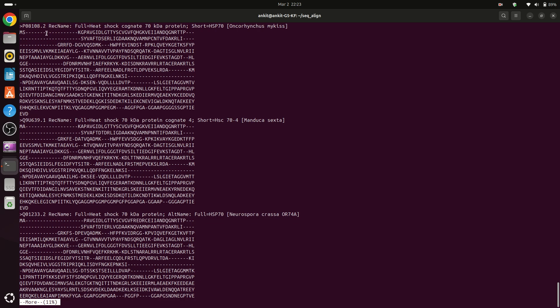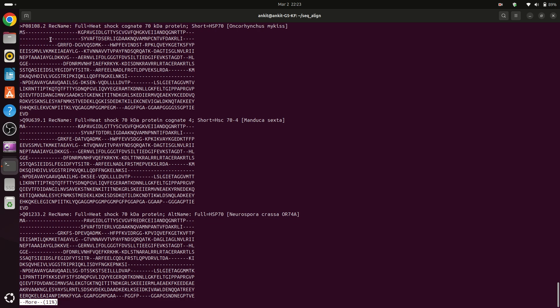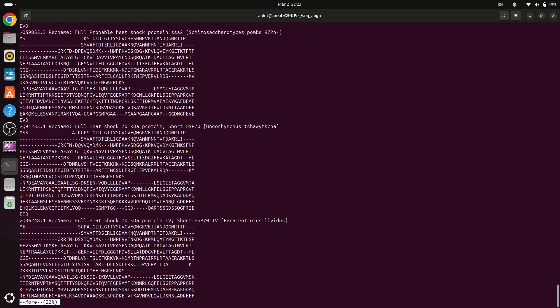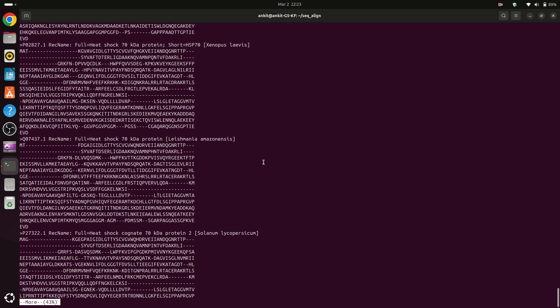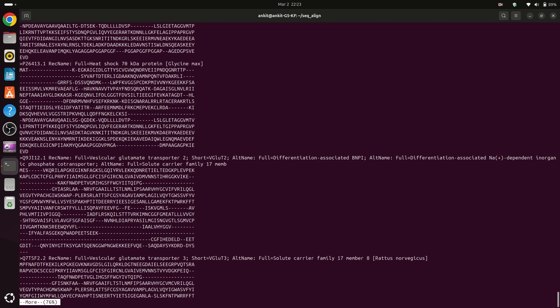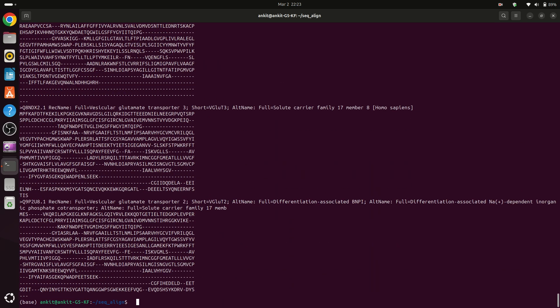Enter. So we can see that our aligned sequences are here and these are the gaps and so on. All the sequences are aligned using MAFFT. So this is very fast.